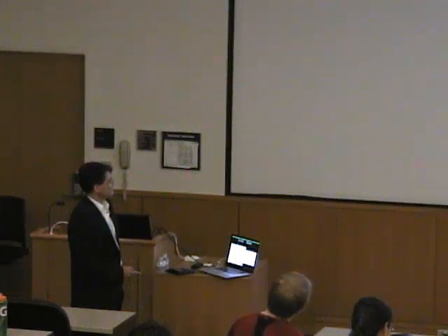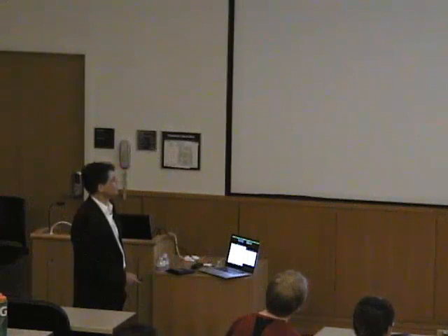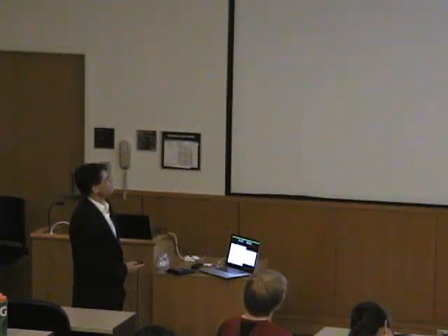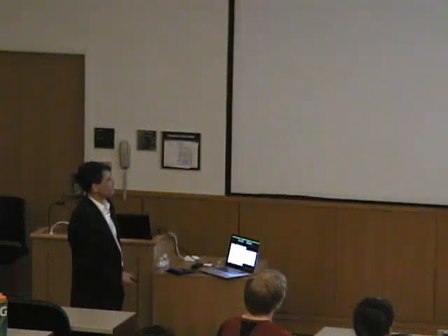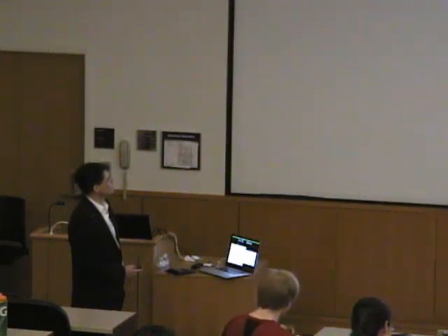And so that is the so-called ORD spectrum. The ORD spectrum is rarely measured these days, but what is instead measured is the circular dichroism spectrum. And the circular dichroism spectrum is the differential absorption of right and left circularly polarized light as a function of wavelength.